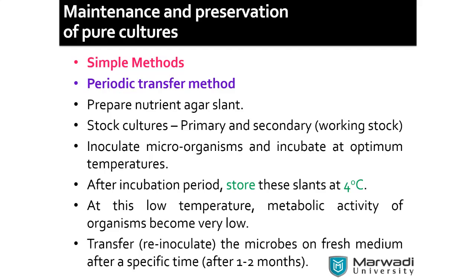While we are opening the tubes, it is between the two burners. And another thing is we may sterilize the mouth part, or we may pass it through the flame. Then it does not allow other microbes in while opening or subculturing.